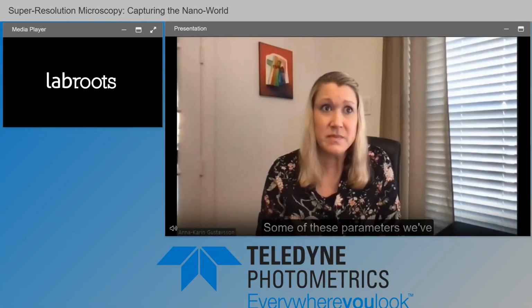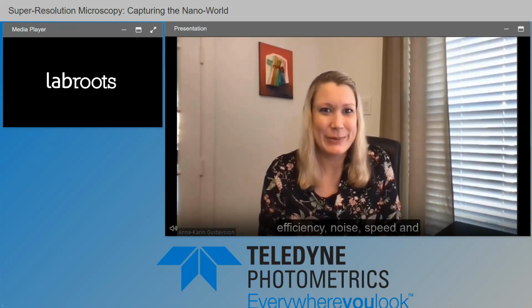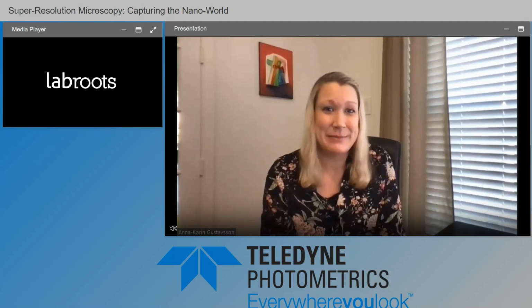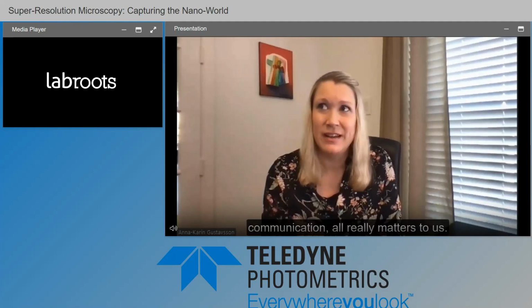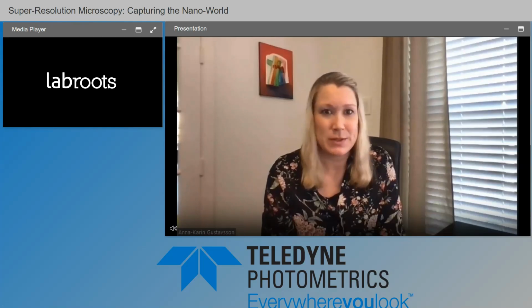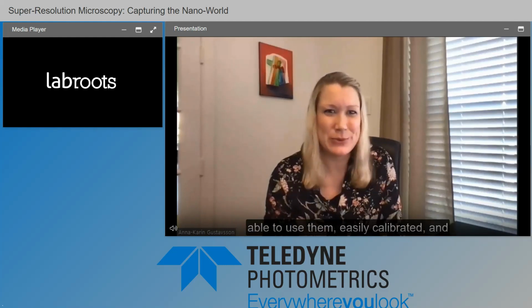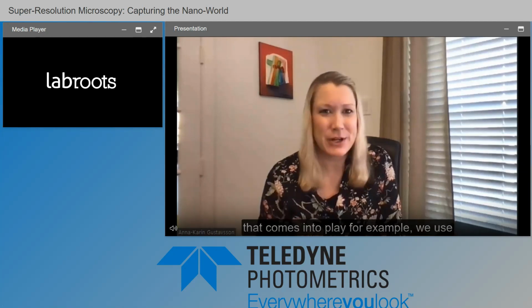Yeah, as I said, some of these parameters we've already touched upon, like quantum efficiency, noise, speed, compatibility with software and that hardware-software interface and communication, all really matter to us. Of course, we want them to be user-friendly, especially for more and more people to be able to use them. Easily calibrated, and that comes into play.